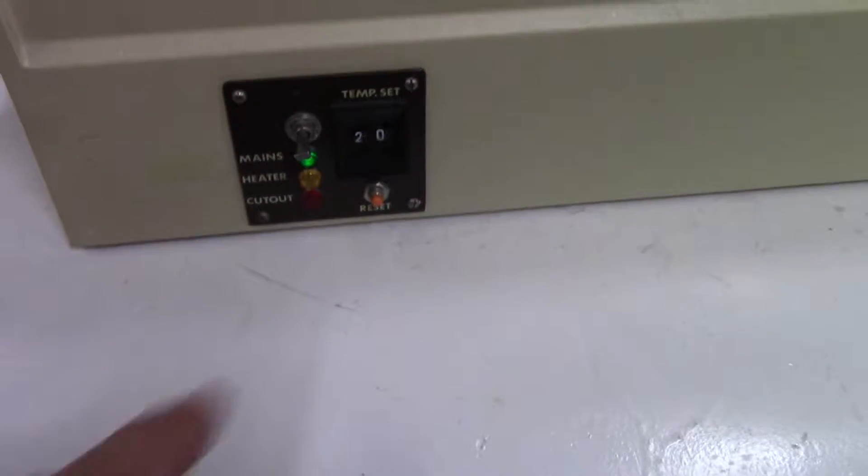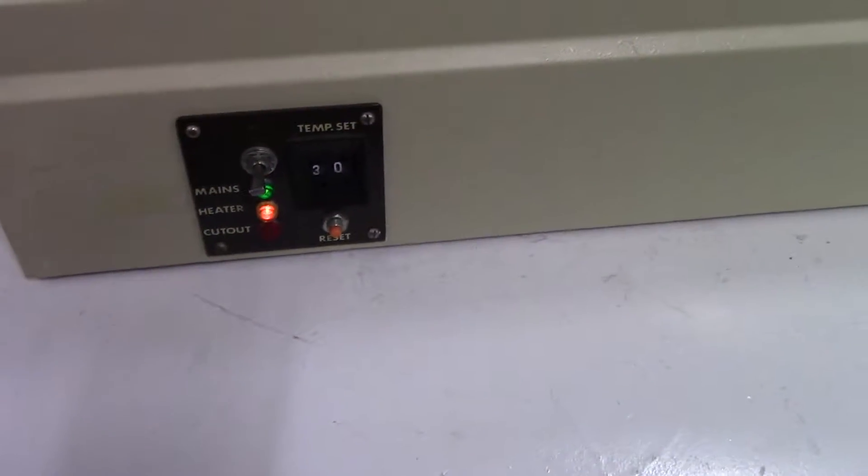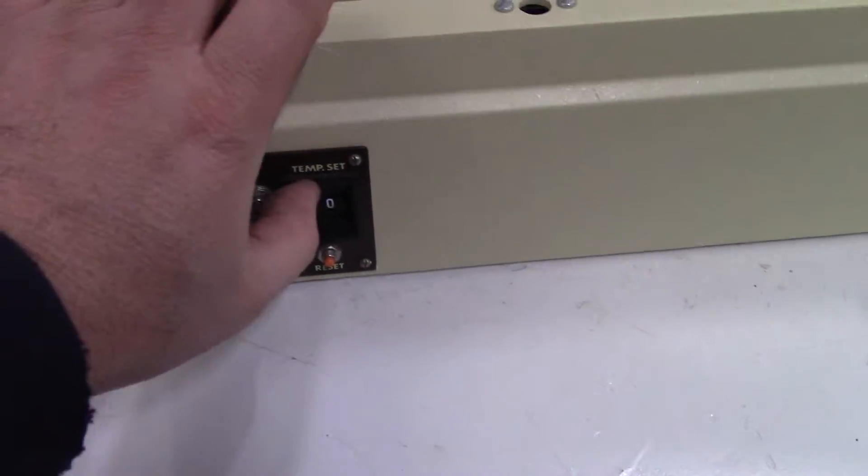Let me see if we see the flashing light. If I turn it solid, it'll regulate the temperature.